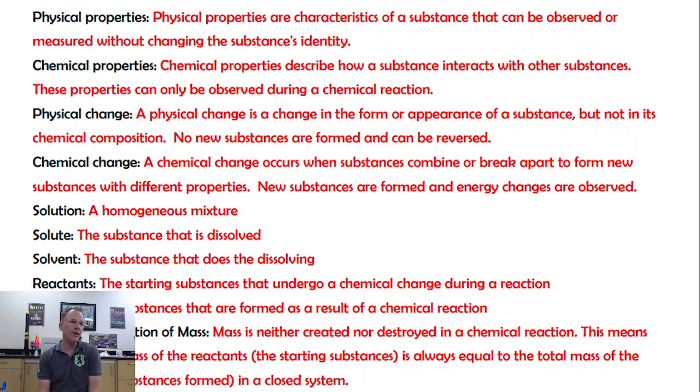But what if there is no reaction? What if you dip copper into the silver nitrate and nothing happens, and you leave it there for days and nothing happens? Is that a chemical property of copper? That nothing happens? Yeah. If you know that copper and silver nitrate do not react, that's useful information.